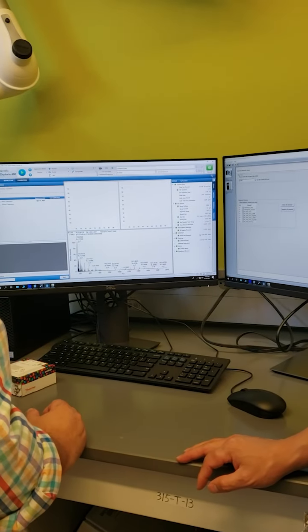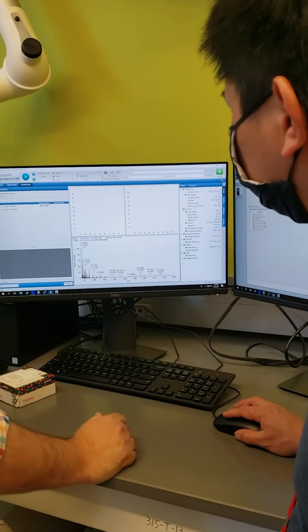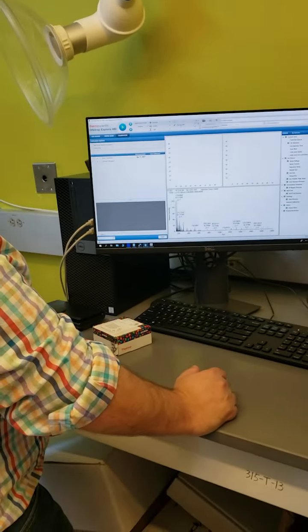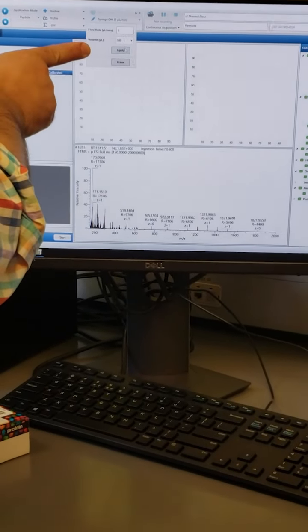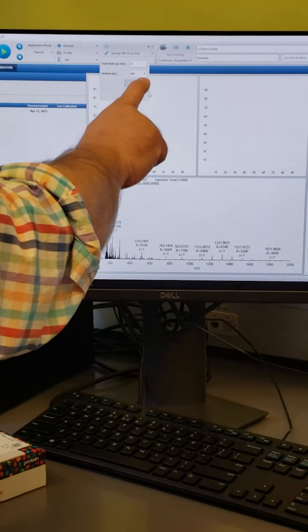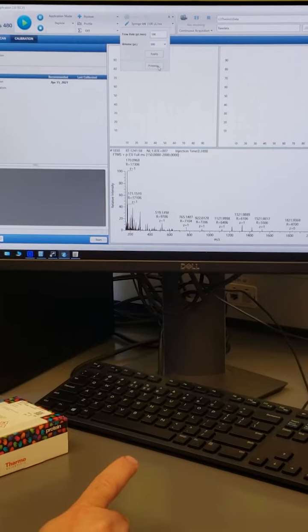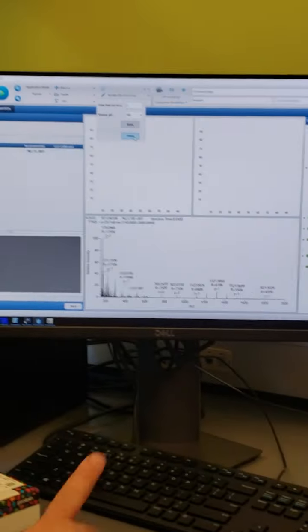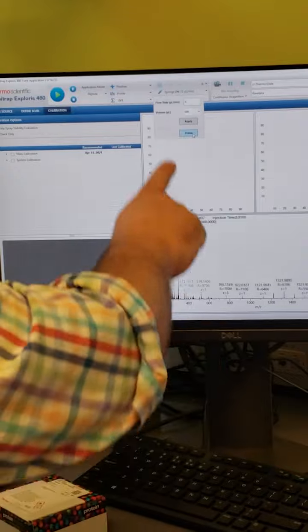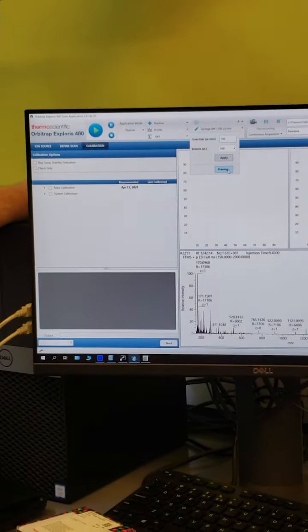All right, so let's turn on your syringe, and right here, go turn syringe on. Okay, and then here, drop down. So you have a flow rate, a volume, which is the syringe. It's 500, and then let's do prime. So press it and hold it once. Click and hold left click. And all that does is it changes it to 100 microliters per minute briefly. If you keep pressing it over and over again, it'll get stuck and it'll get upset. So just click and hold it one time until you start to see some ions come through.